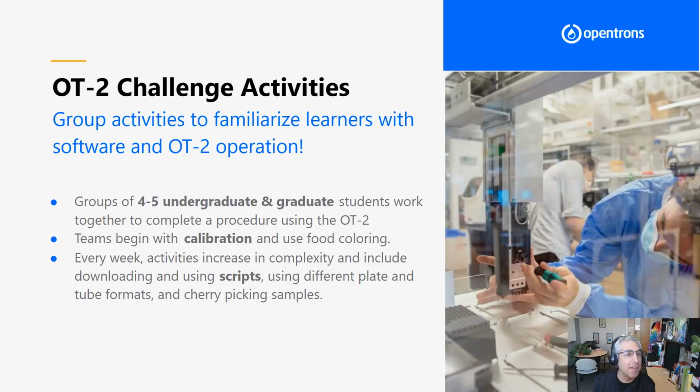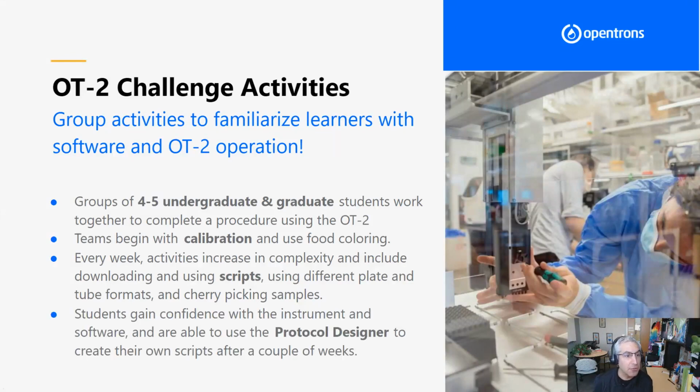And at that time, we were trying a couple of Zymo 96 well plate DNA extraction and RNA extraction kits as part of this class and tying in to that metagenomics class that I have been teaching since 2013. So students progressively gained confidence with this instrument.